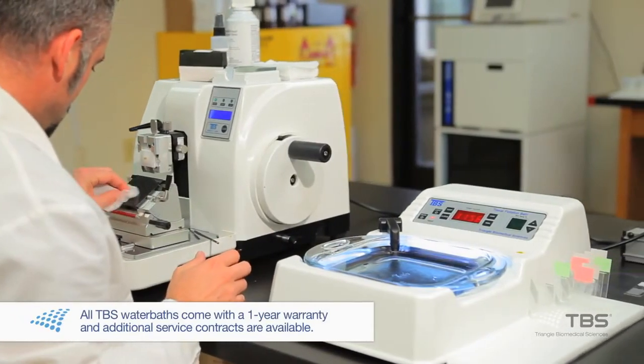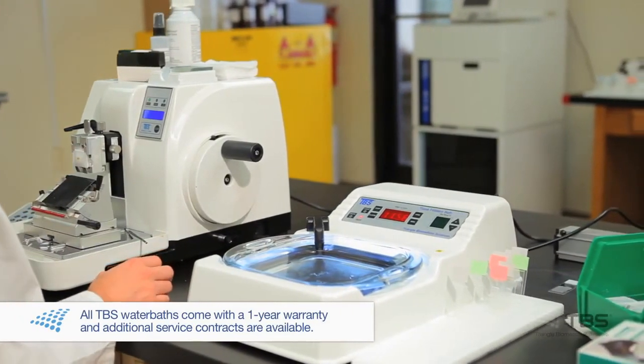Another reason that I like the TBS water bath is I worked with an older one and it was big and bulky. This one allows more space and the slide drying racks are very convenient. Another feature is the deeper dish — it allows better orientation and allows me to turn out better samples at a quicker pace. Overall, I am very pleased with the TBS water bath and I look forward to placing an additional order for a water bath this week.